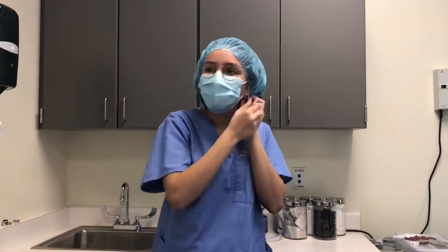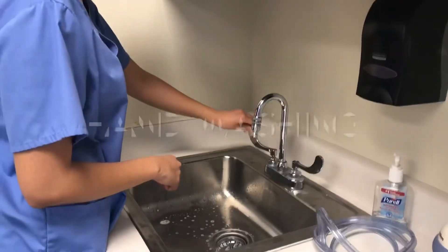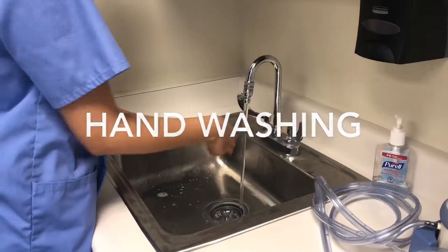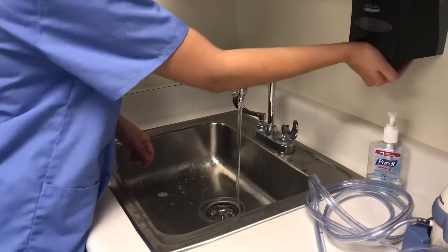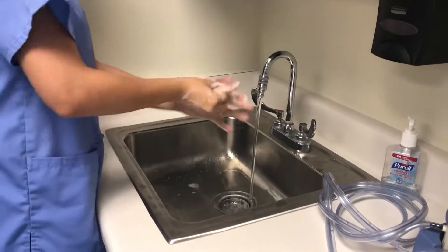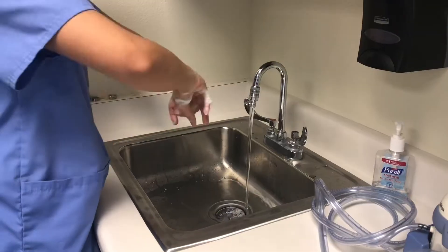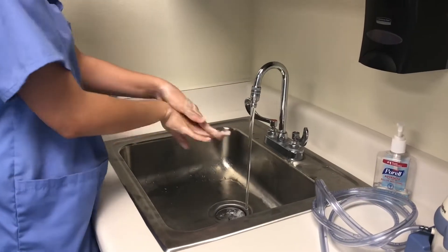In order to follow USP 797 standards, remove all jewelry. Turn on the faucet to a lukewarm temperature, then apply soap. Be sure to scrub your hands vigorously — get between your fingers, under your nails, and all of your forearm, but not going past the elbow.